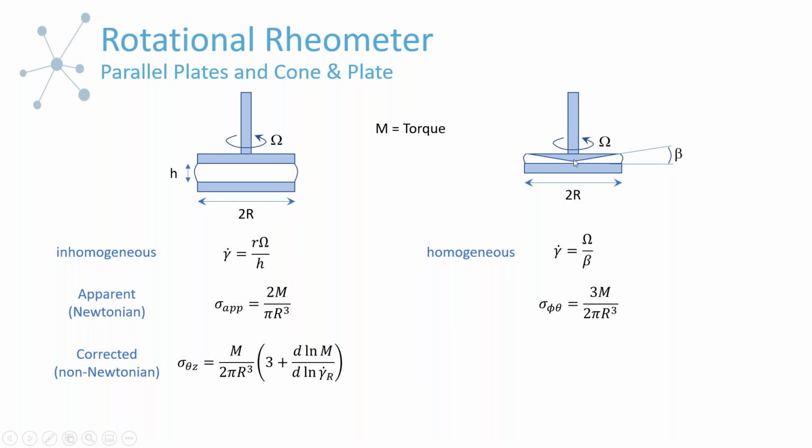And so if you remember, the general rule here for the shear rate is going to be the linear velocity divided by the gap. And so what we'll see then is that the linear velocity, which is going to decrease as we move inward, because it's going to be proportional to r, is going to decrease in proportion with the gap height. That's the nature of the cone geometry.